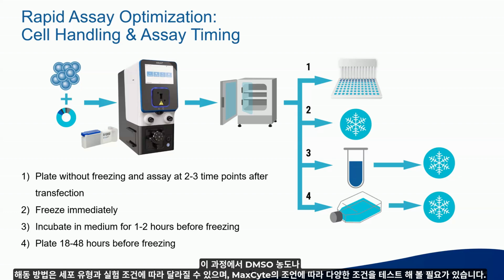After that, you can incubate the cells a little bit before you plate them at different times before freezing, and also try different ways to thaw them, because it can vary depending on the cell type and the experiment.